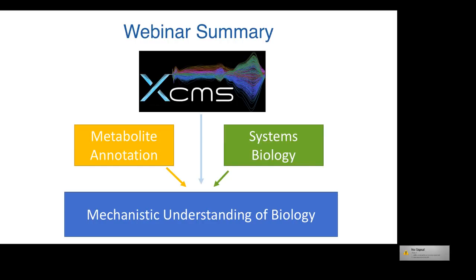Okay, sounds like a really cool experiment first. When you have large data sets like that, the type of job you're going to use will depend on the question that you're asking. If you want to know what's different between them, then you're going to use our pairwise jobs, and you'll have to do multiple versions of pairwise jobs. In the example I was showing today, I actually have about 10 different pairwise jobs that relate to that, but I was only showing you one of them. So that's a way to individually dissect them.